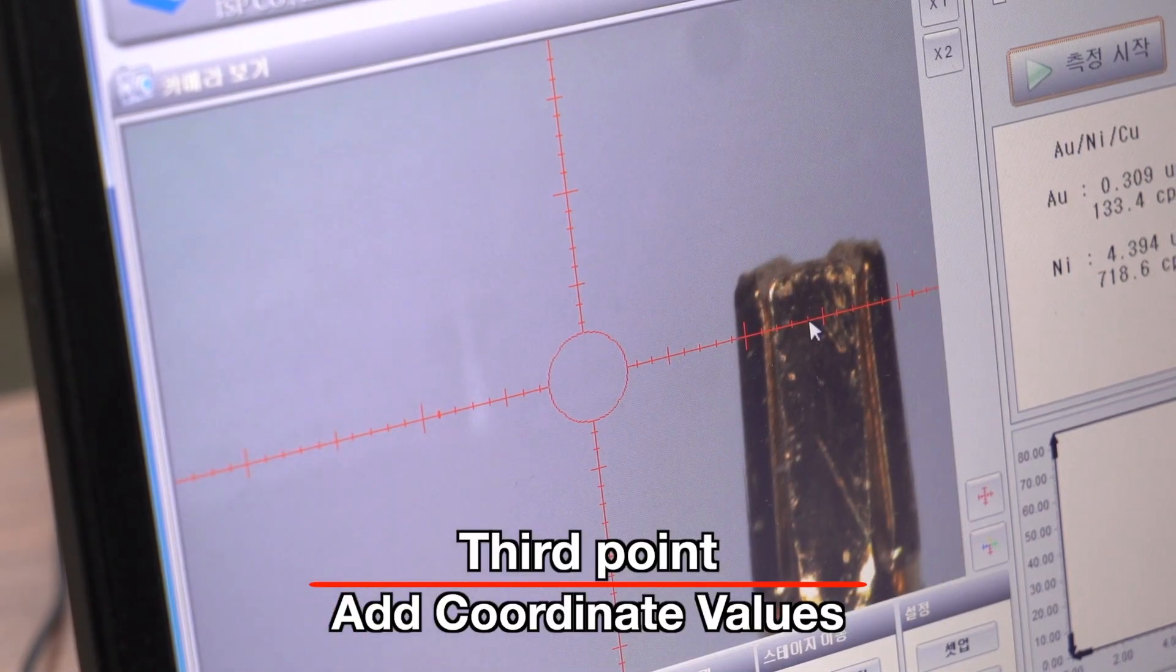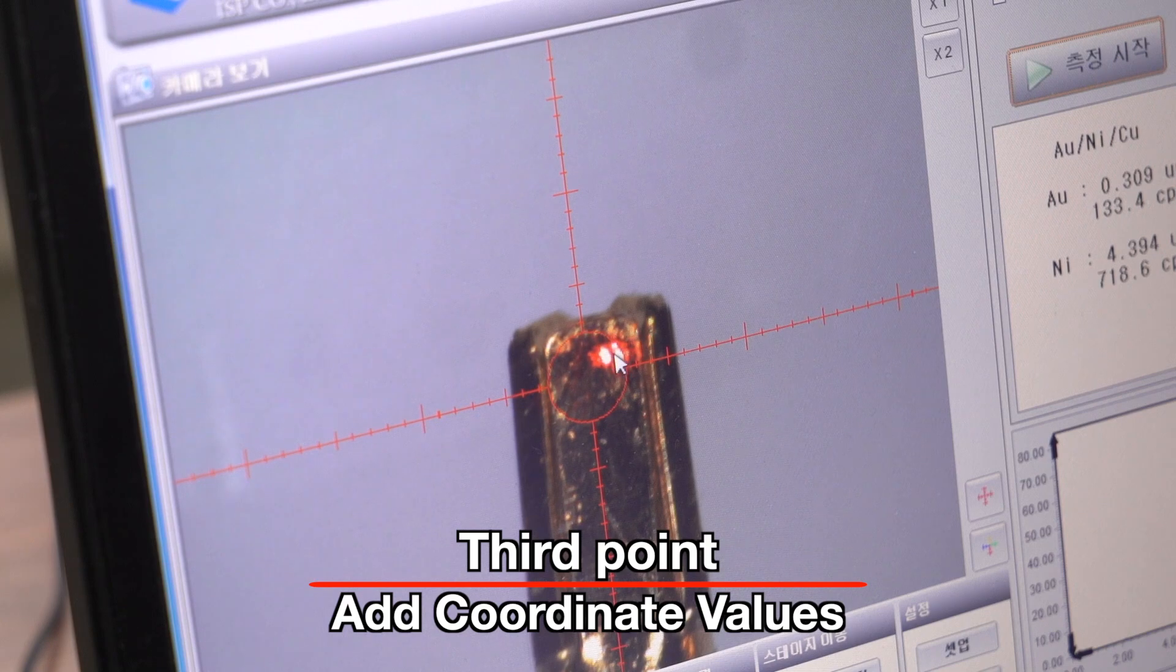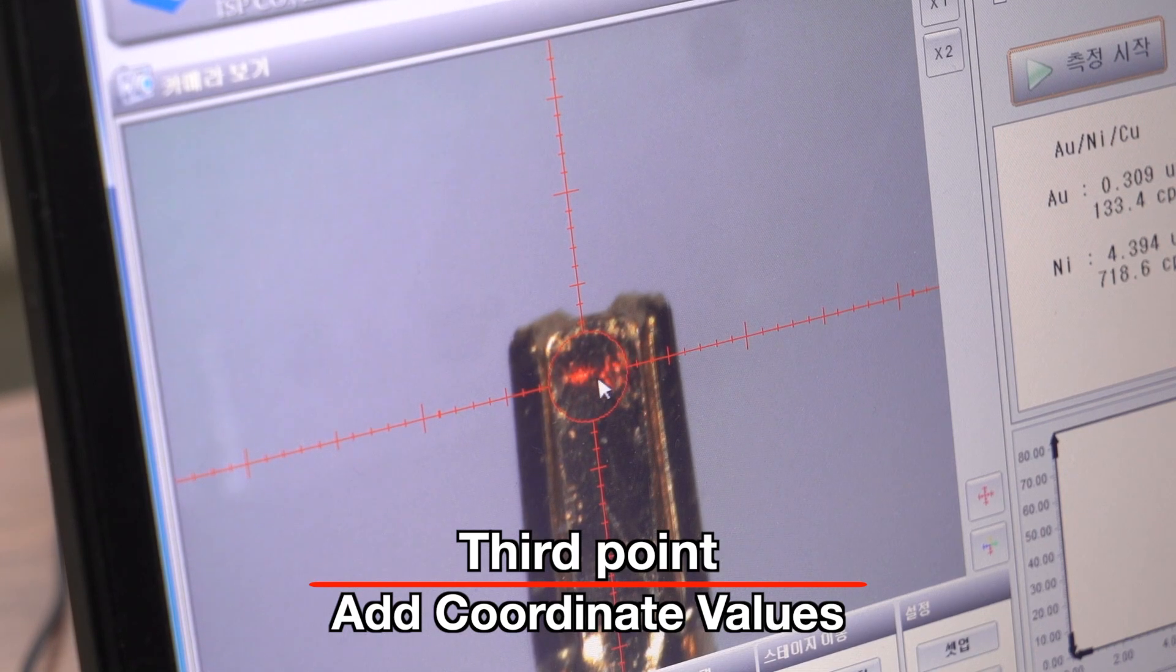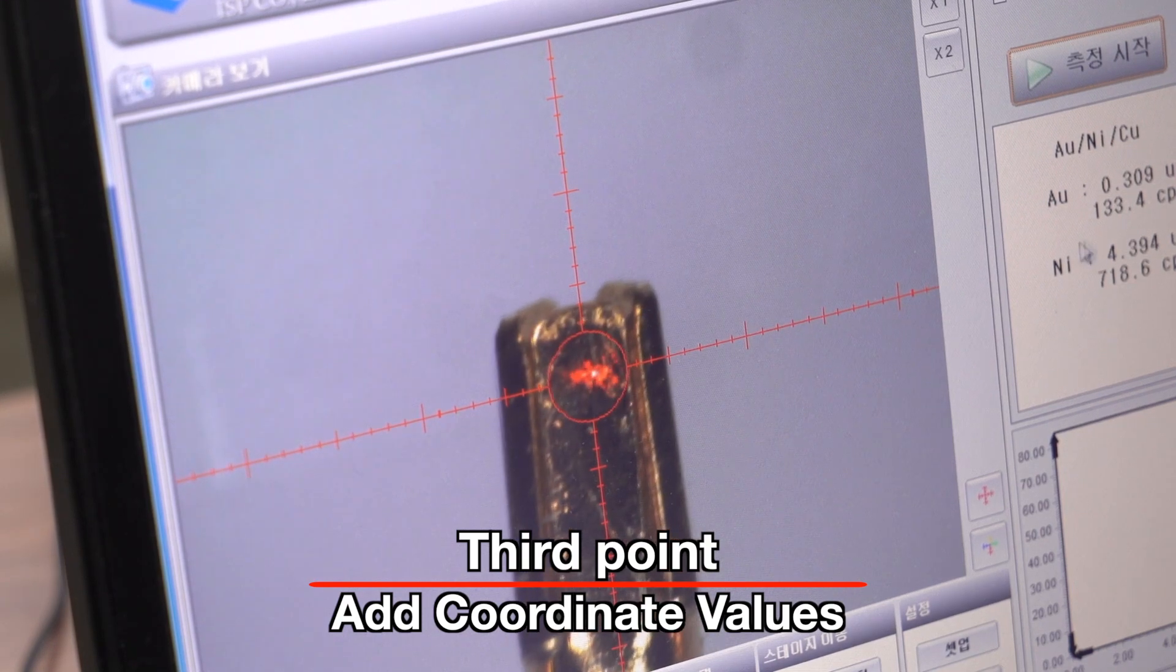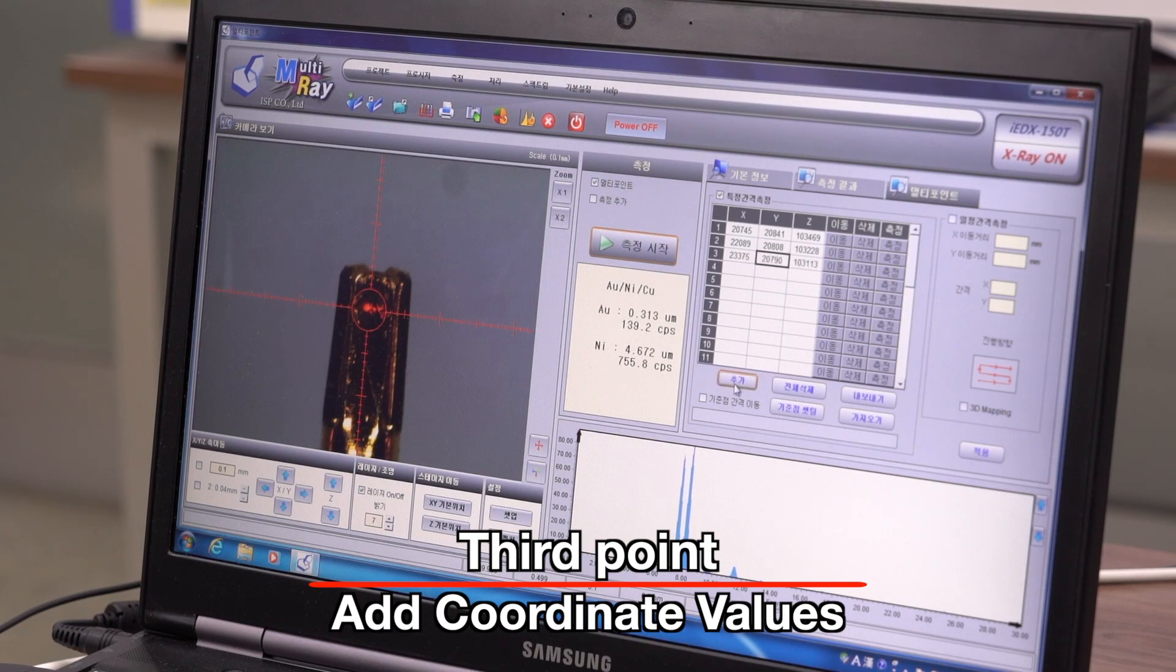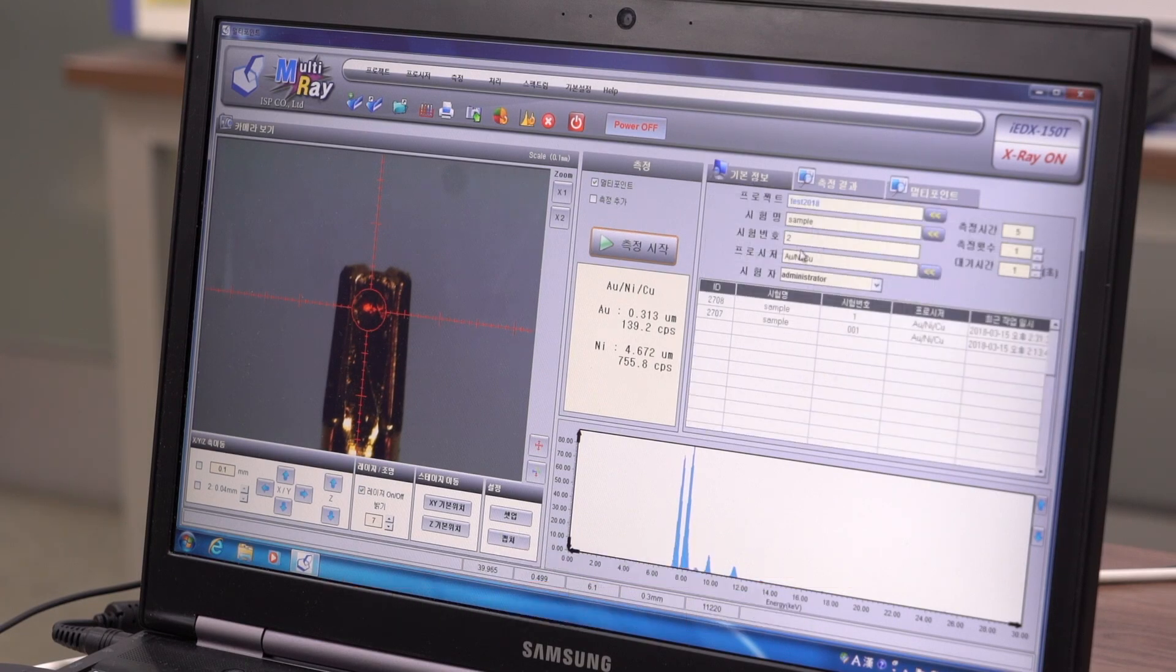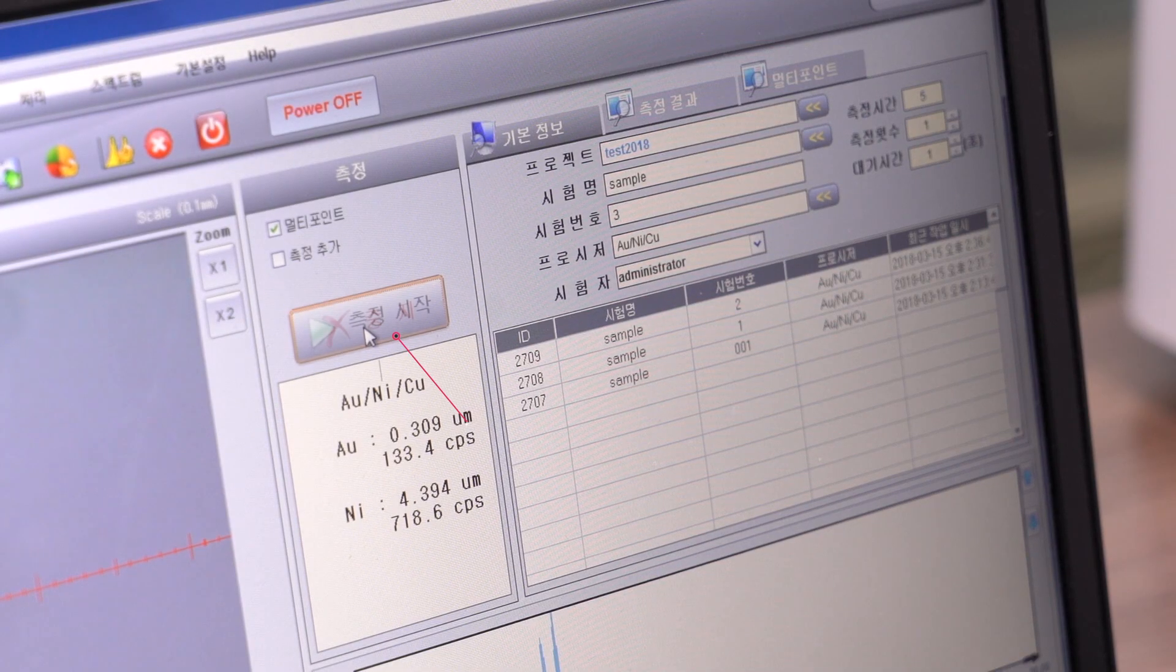Move to the next position. Press the add button again. After confirming the basic information, press the measure button.